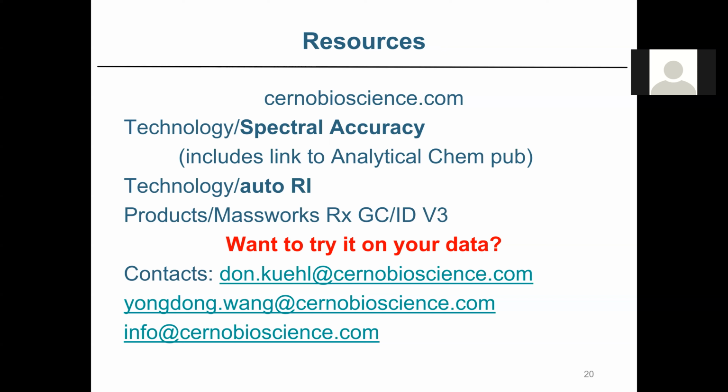Next question, is it possible to customize the columns in the report, for example, adding the CAS numbers to the peak hit list? Oh yeah, the reports are totally customizable.